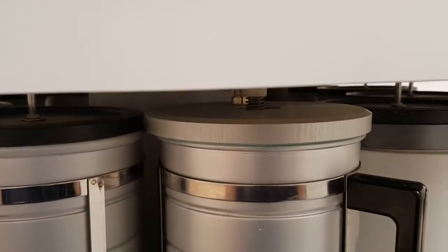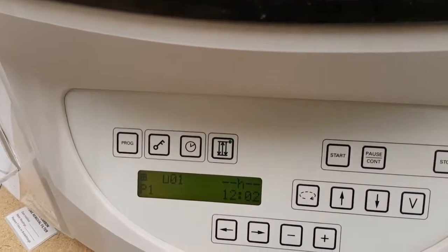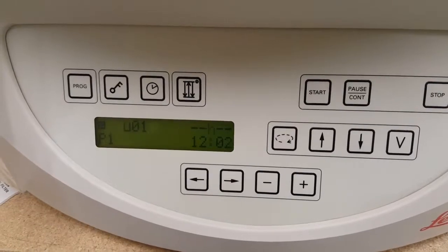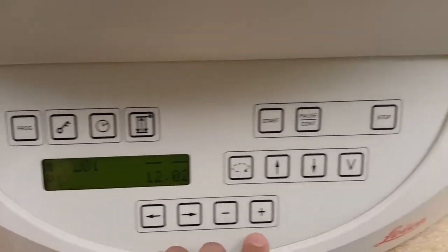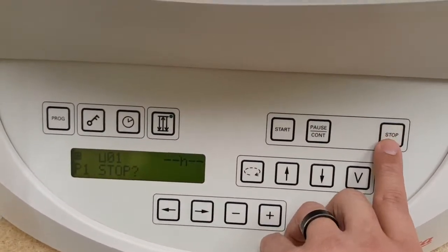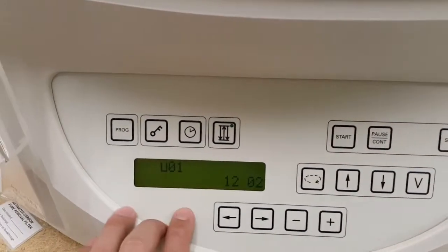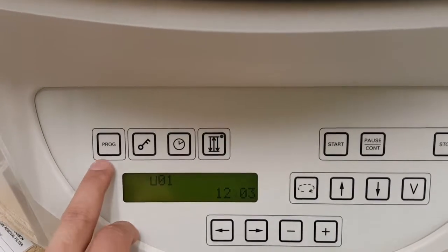This is your agitation button — if you don't want it to agitate like it is doing right now, you can press that button once and it will stop agitation. I'm going to stop this right now. If you want to stop it, you press stop twice and you're back at the main menu.